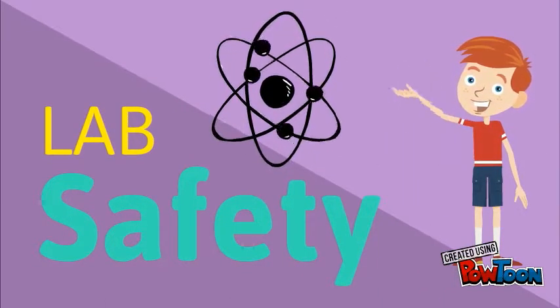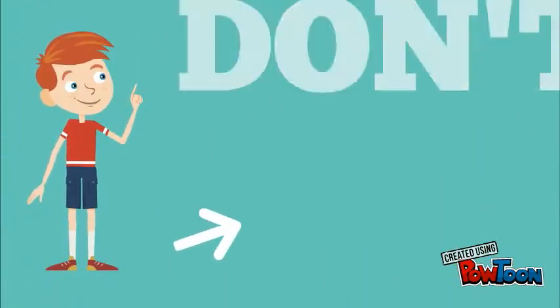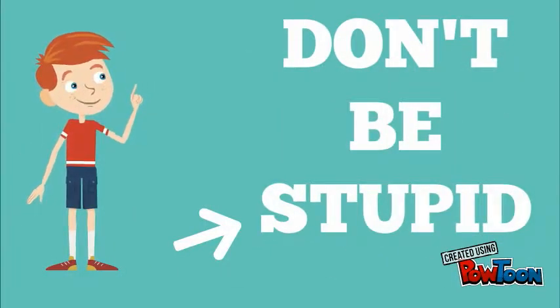Lab safety. Before I start listing rules and regulations, there's one very simple one. It's don't be stupid. But it's easier said than done. Just please use your common sense.